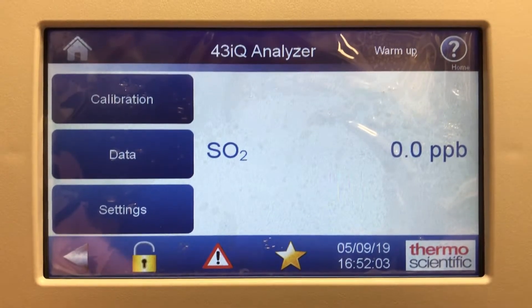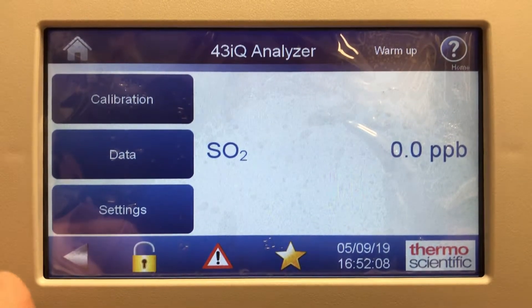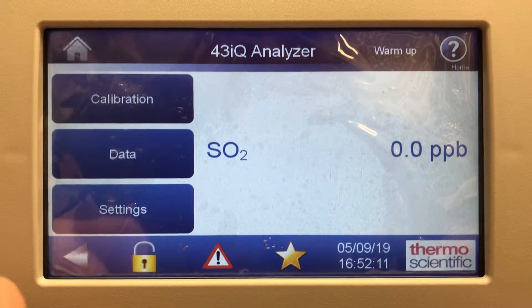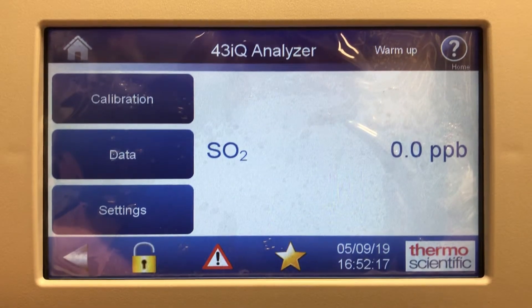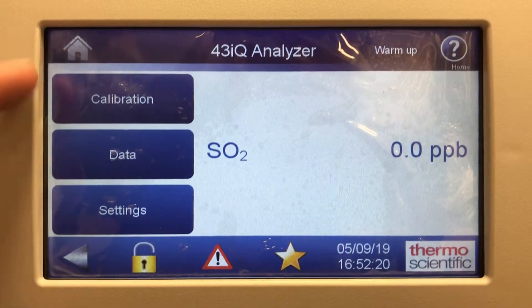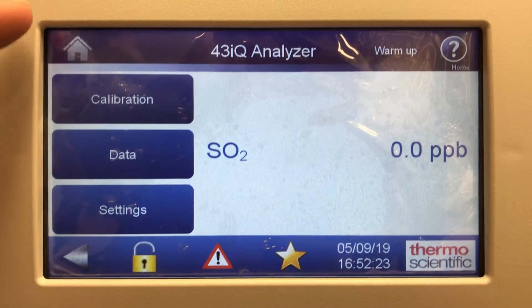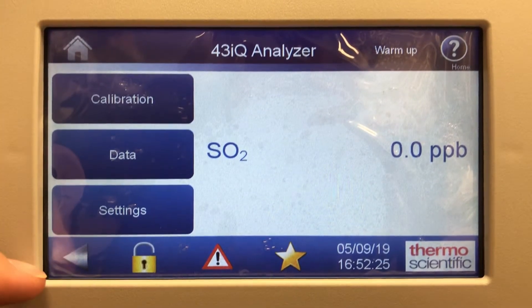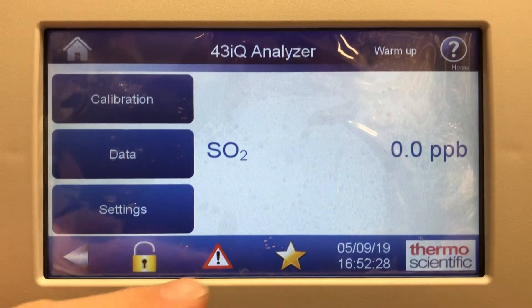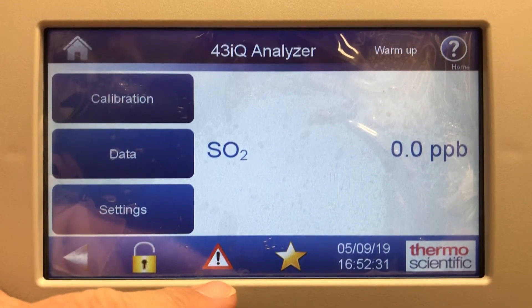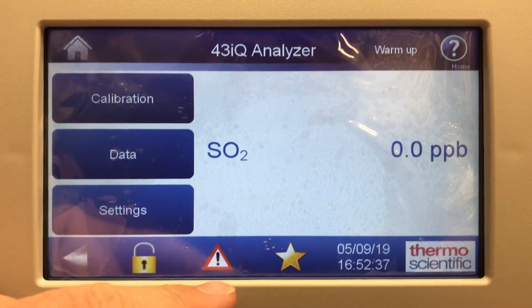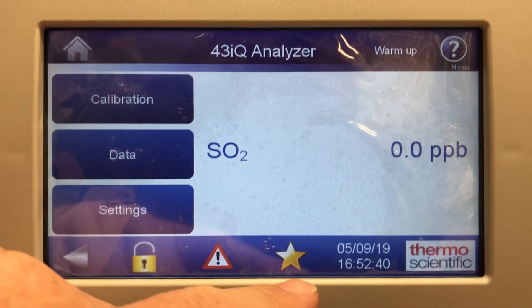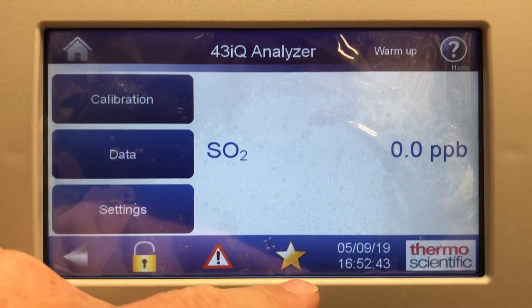Hi everyone, Jim with CDNova Instruments again. Today we are looking at the menu of the Model 43i Q SO2 analyzer from Thermo Scientific. This analyzer is very similar to the other ones I've shown, where they have calibration data and settings buttons on the left side of the screen. They have a home button, a back arrow button, password lock, and a status screen. If there's a green check mark everything's okay, and if you see a red triangle with an exclamation point then there's a status alarm. There's also a favorites button where you can jump into screens quickly.